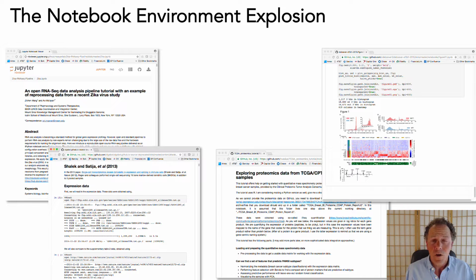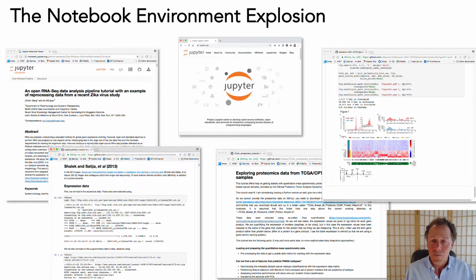By now, everyone in any field related to data science is familiar with analysis notebooks. Although notebook-based systems have existed for many years, the Jupyter Notebook environment was the first to capture the wider needs of data scientists and scientific users. This is due to the unique benefits of the notebook environment of reproducibility and support for both live code and associated text and images within a single document. However, for genomic and bioinformatic analysis, the notebook metaphor presents a number of challenges.